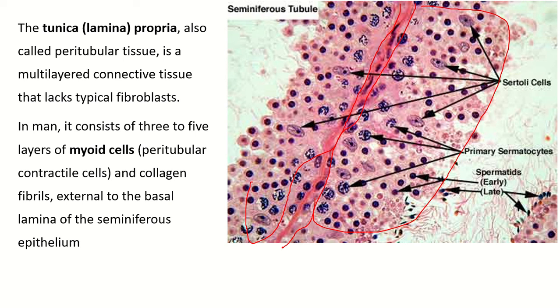The tunica propria contains a cell called the myoid cell. This is the Sertoli cell — Sertoli cells are present throughout the whole thickness of the seminiferous tubule. You can see the Sertoli cell contains light stained nuclei with prominent nucleolus, and the shape of the nucleus is oval.